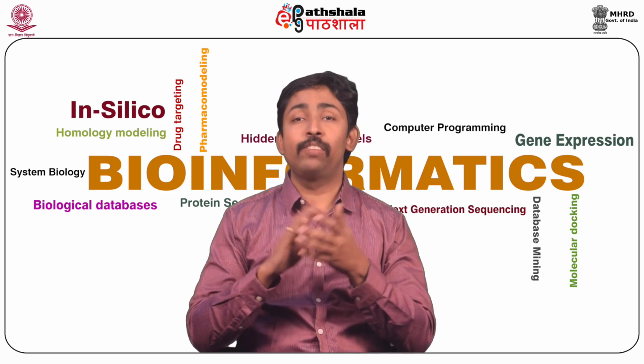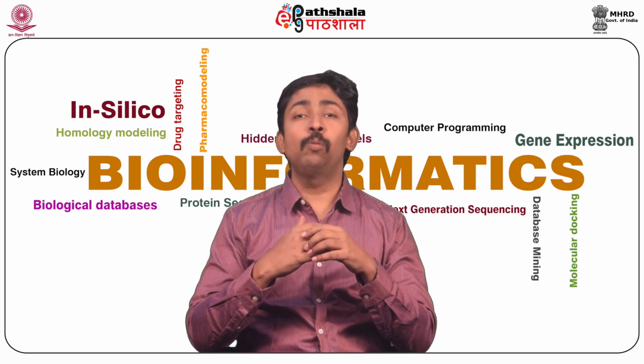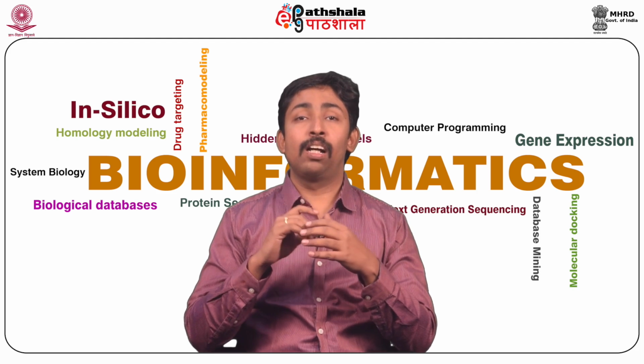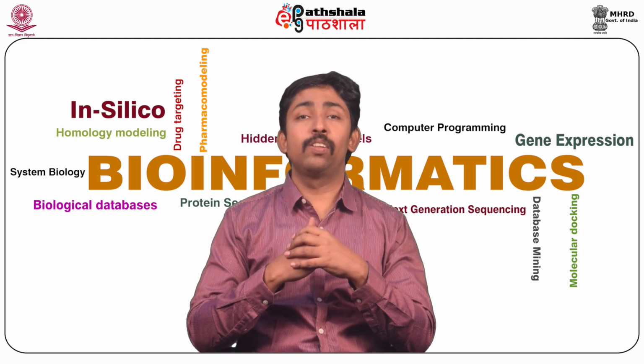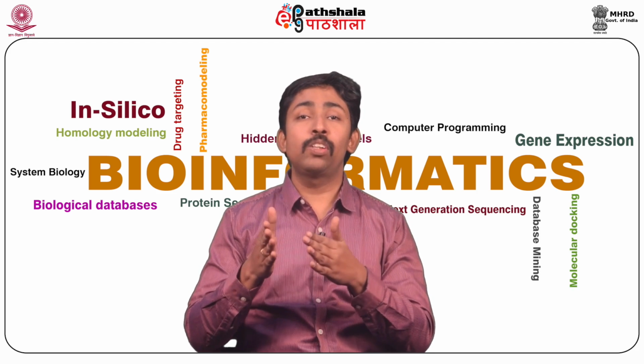What we need is a regular iterator. So we can use a regular Python for loop, inside which we can use Bio.AlignIO.parse. It gives multiple sequence alignment objects which can be used in a for loop.